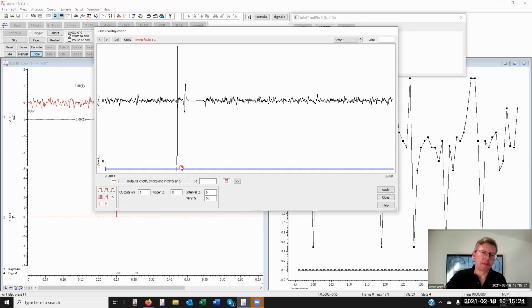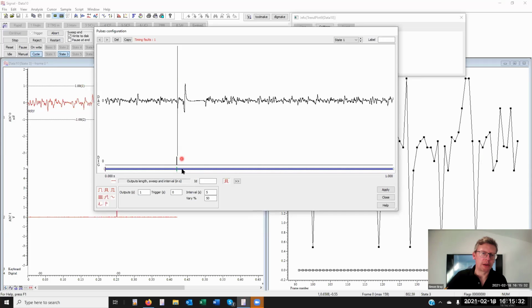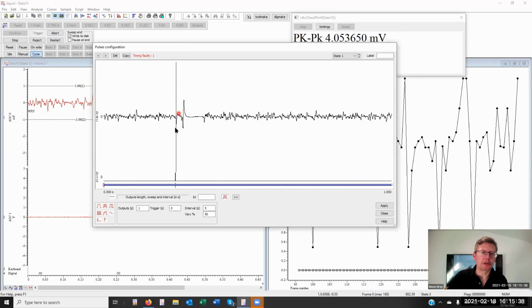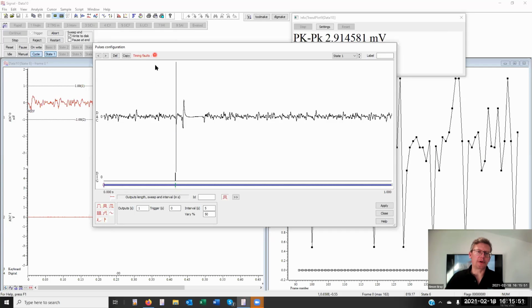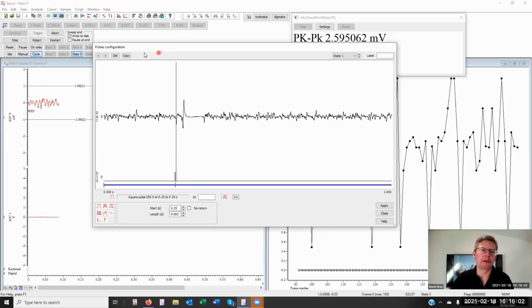At the moment, I'm trying to place this marker at the same time as this digital marker on dig out 0 here. Because of the sequence resolution, the number of clock ticks it takes to execute a command, the two items are colliding when I'm trying to switch off the digital pulse, which causes a timing fault. The quick fix is to extend the pulse length. So the digital output pulse is no longer 1 millisecond, it's 2 milliseconds, and the timing error has gone away.